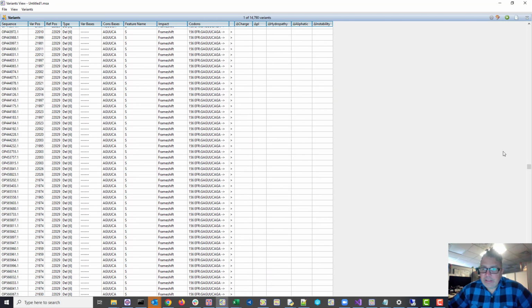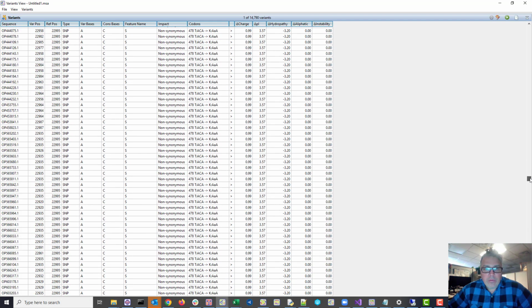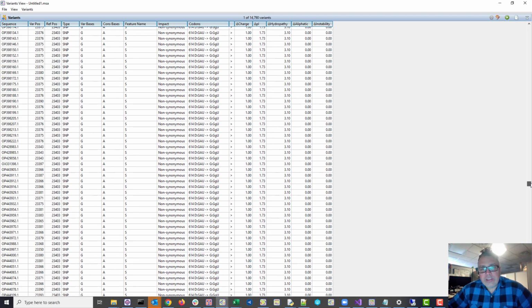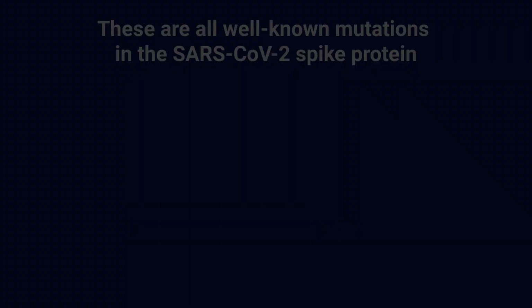At residue 156, we have a call. At residue 452, we have a call. Residue 478, residue 614, and also residue 681.